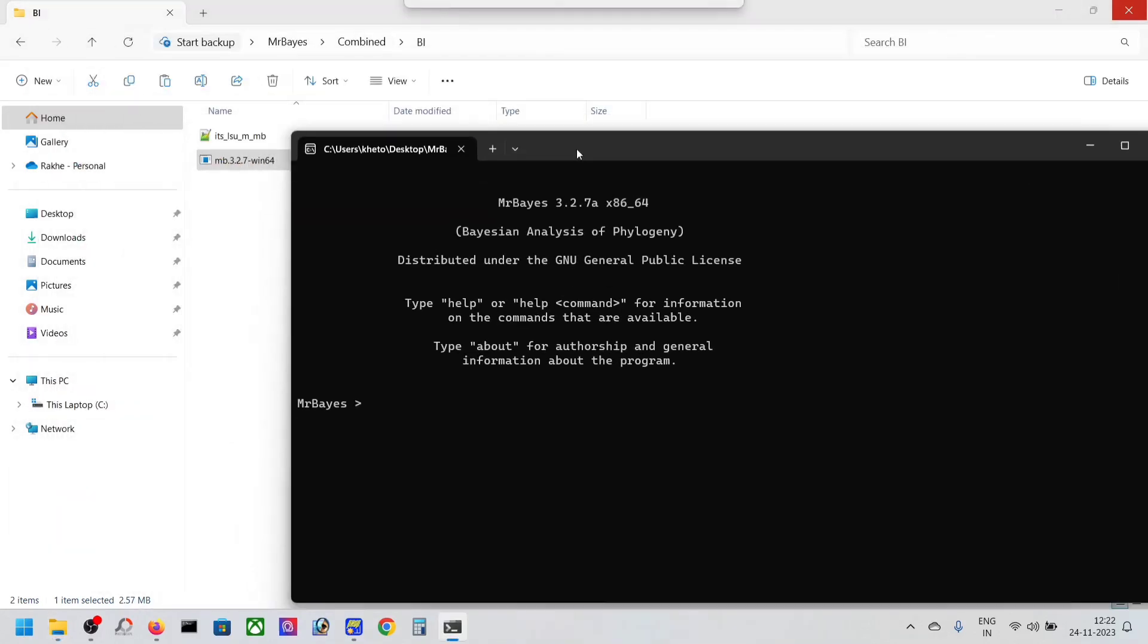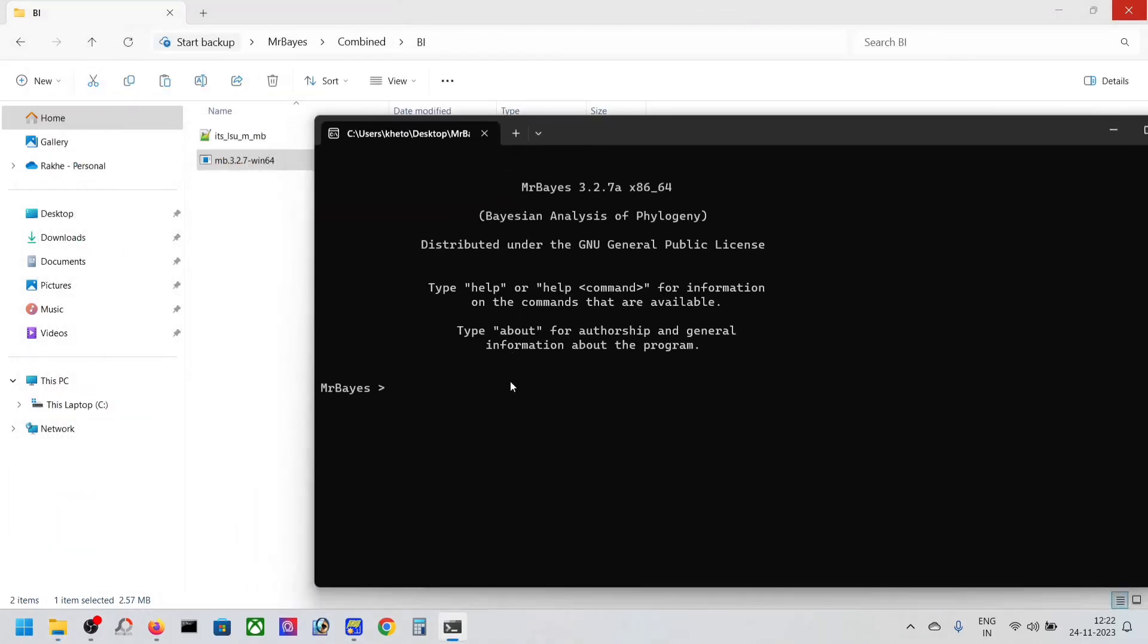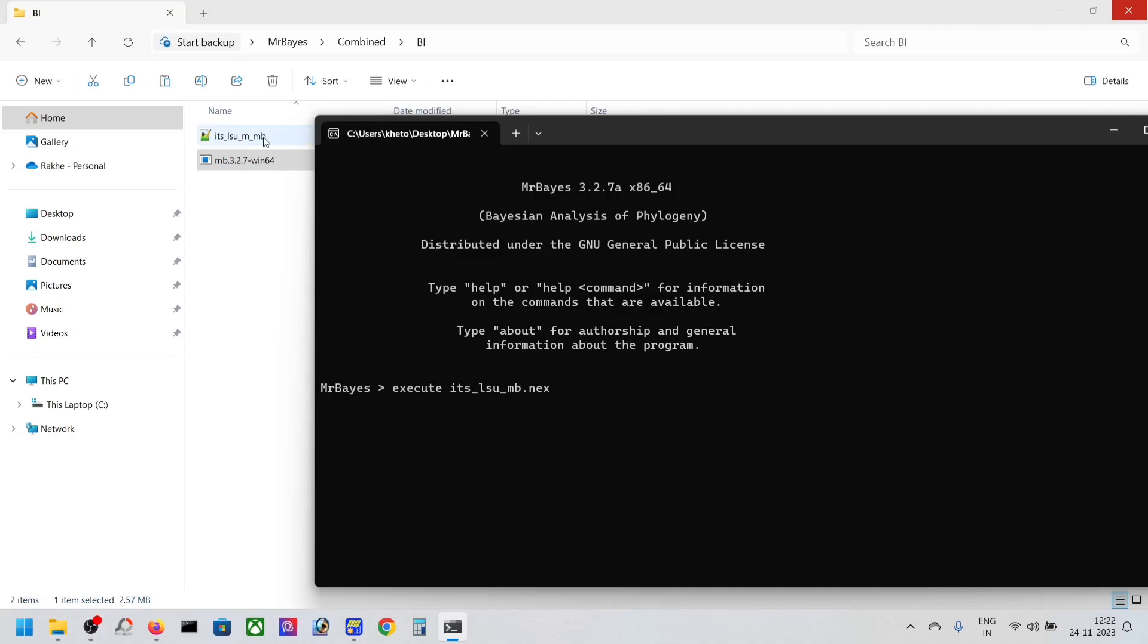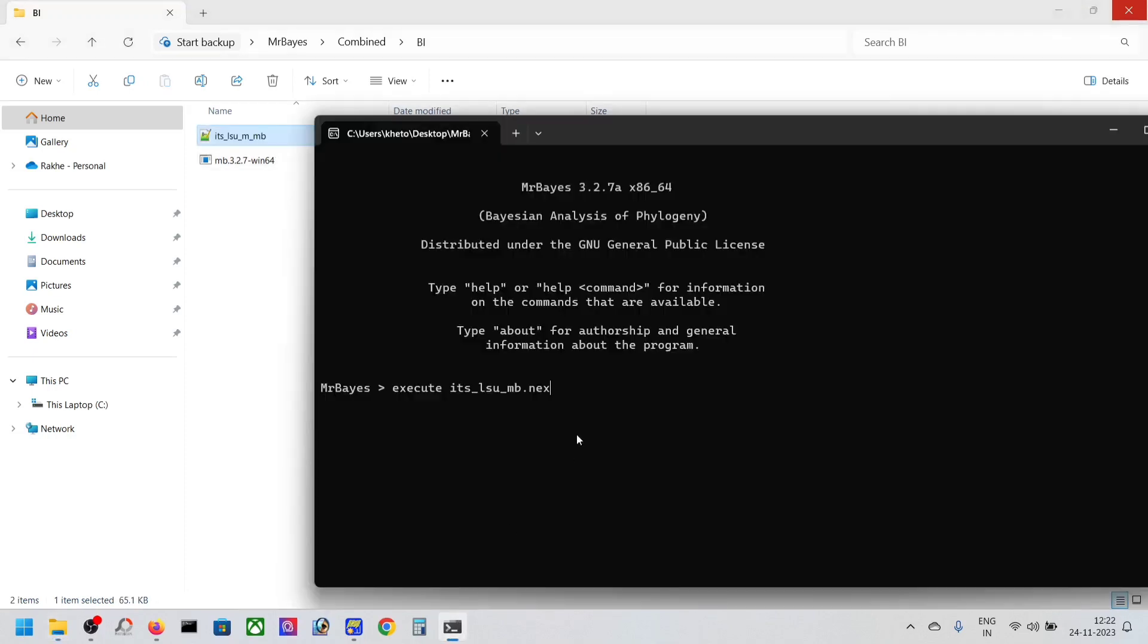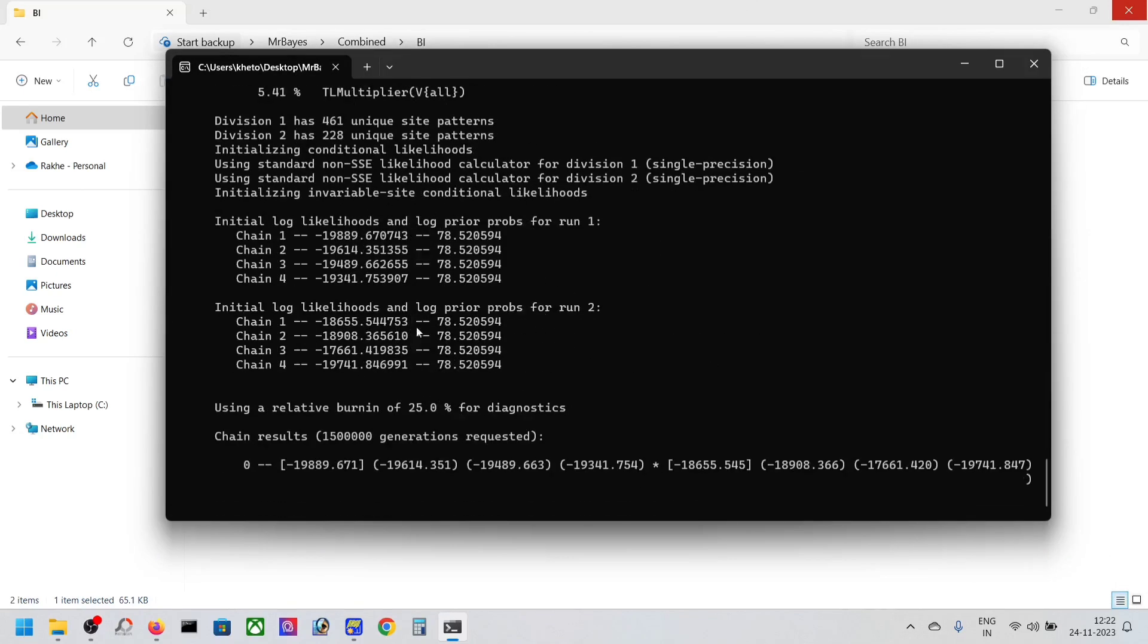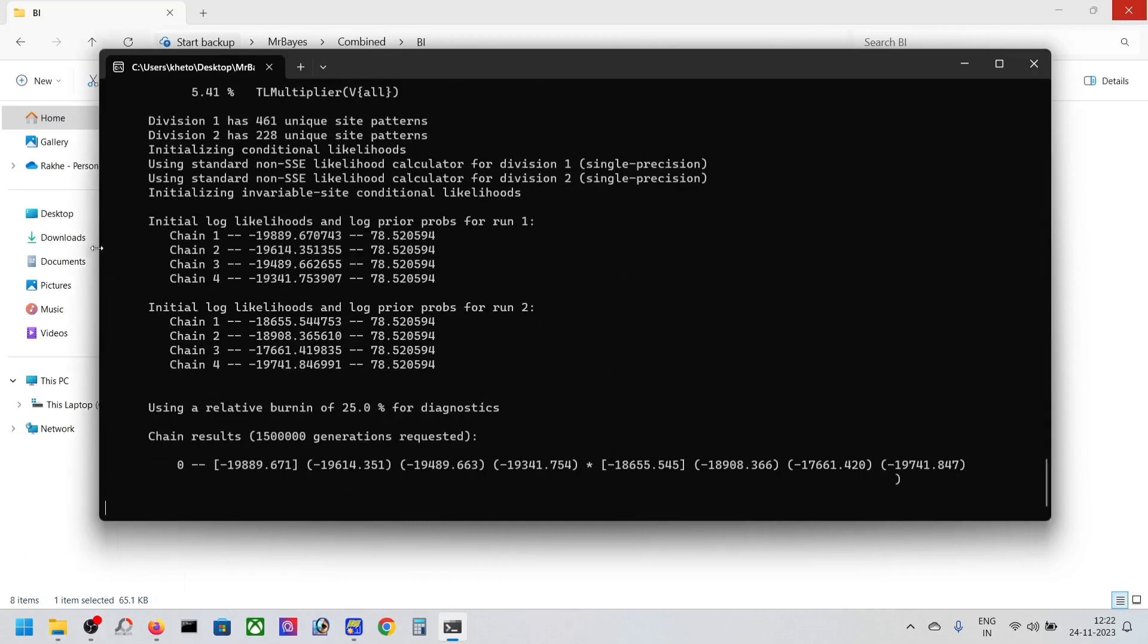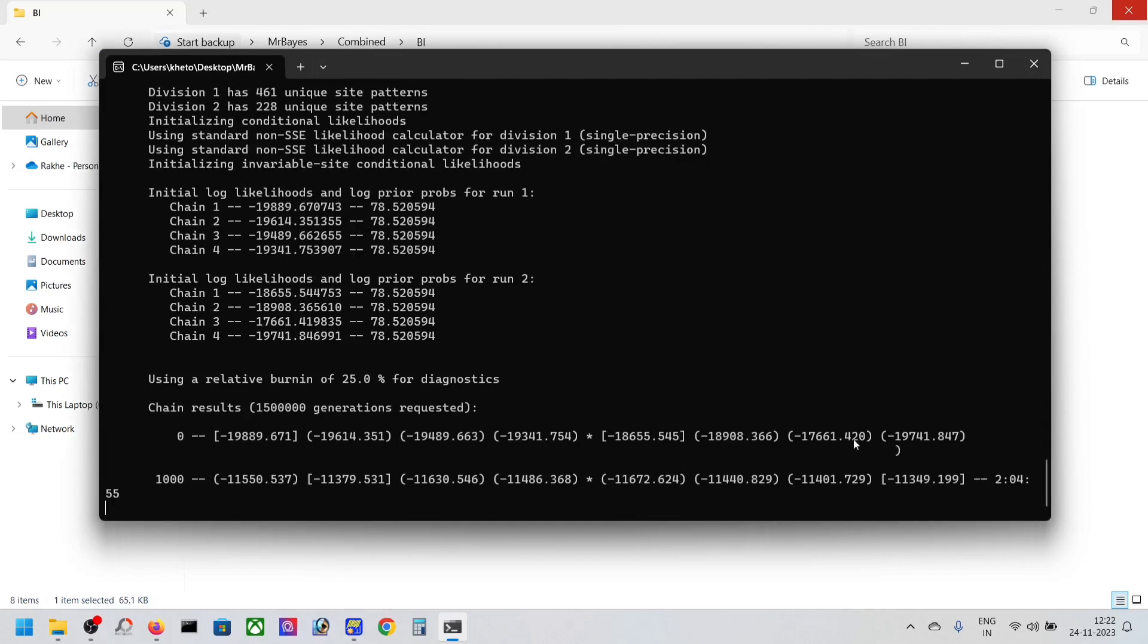Execute. You have to put the file name exactly the same as here. You can do that by simply copying this name and pasting it with .nex. Press enter and it will start. This is how you run your Bayesian analysis.